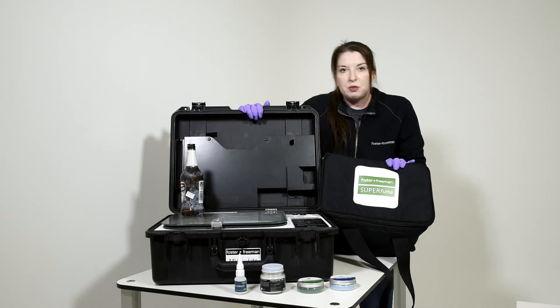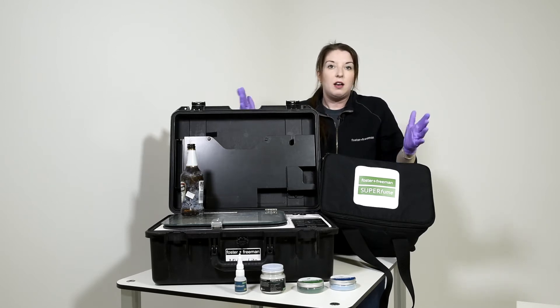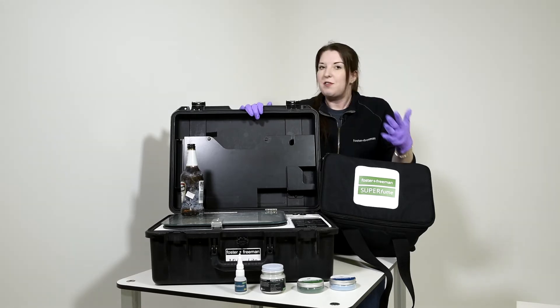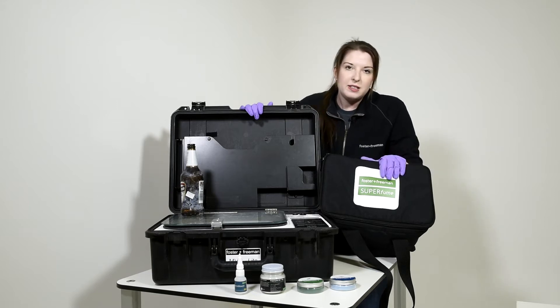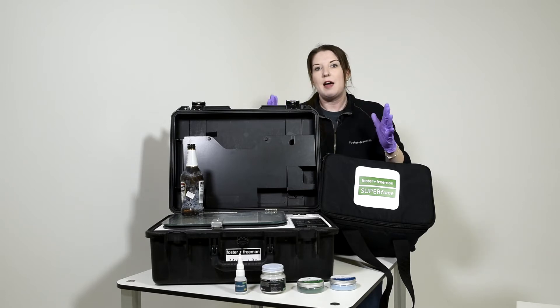We also have our Superfume system, which is another cyanoacrylate fuming system but this time for larger areas. If you're having to deal with a large crime scene — perhaps where the furniture is unmovable, a lot of the evidence is unmovable, or perhaps even a vehicle — we can set up our Superfume system and fume an entire large area.